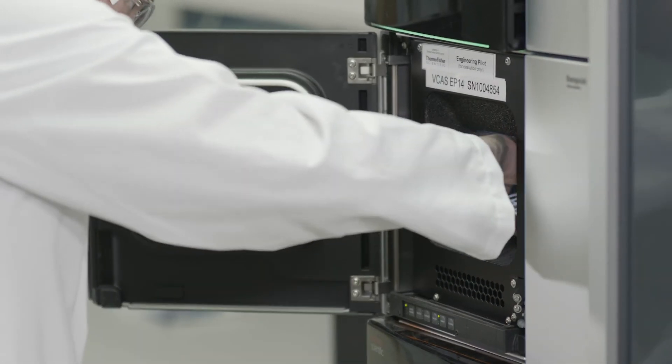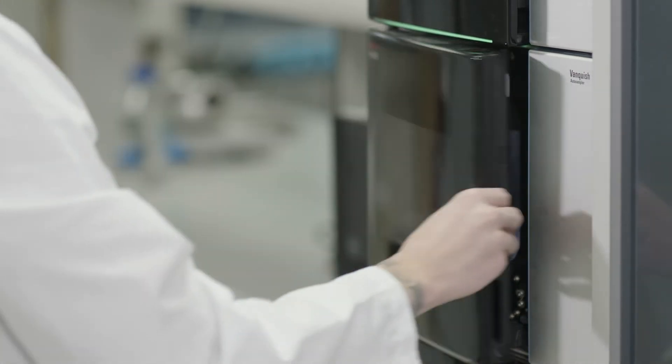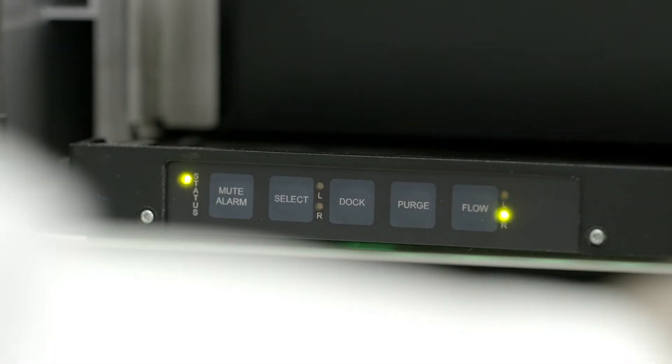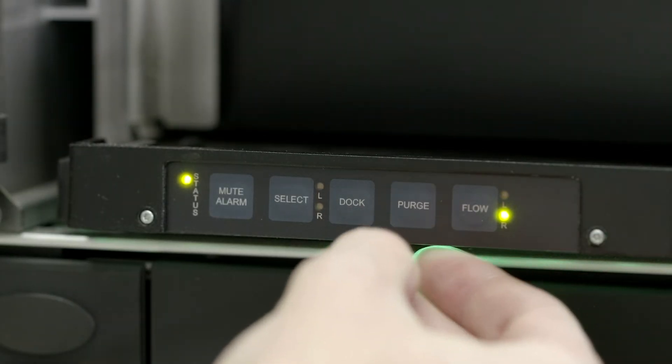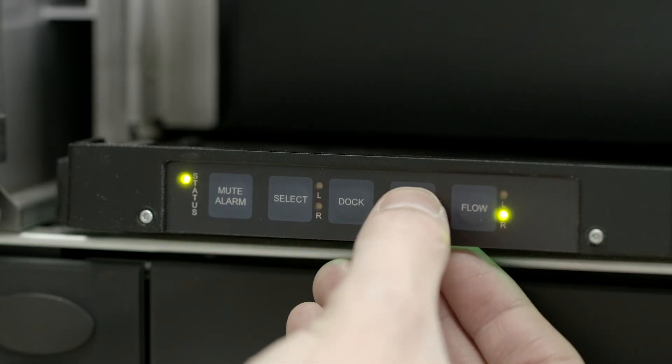A lot of different features, like the manual operation buttons, allow you to intervene if you were logged out of your Chromeleon account and had something running, instead of allowing the system to pump dry. The Thermo Scientific Vanquish Core has buttons such as the Flow button or the Purge button which can turn it off manually without using the software.